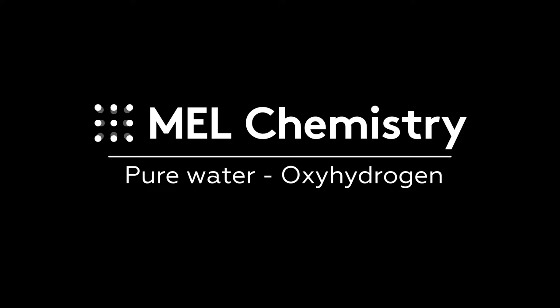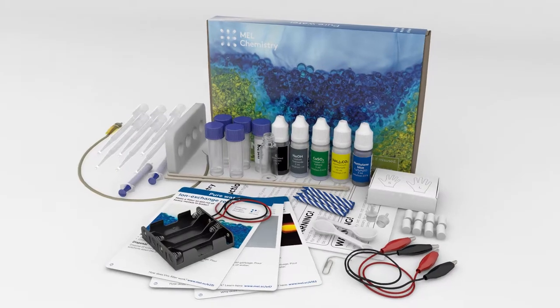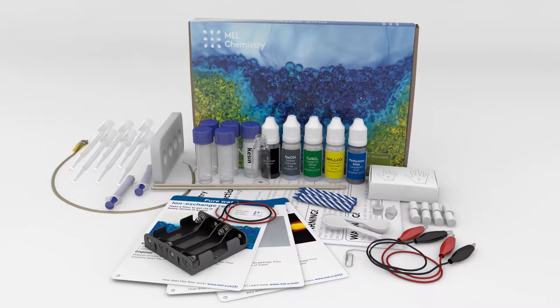Welcome to the wonderful world of chemistry. Today, with the help of the Pure Water Set by MEL Chemistry, we will obtain an oxyhydrogen mixture from water electrolysis.